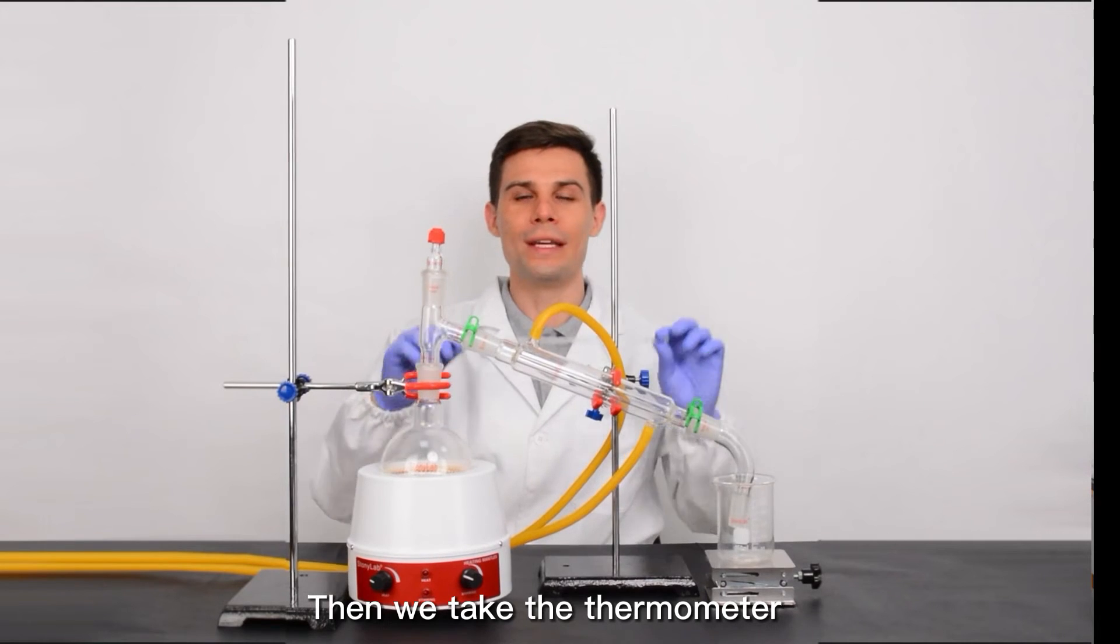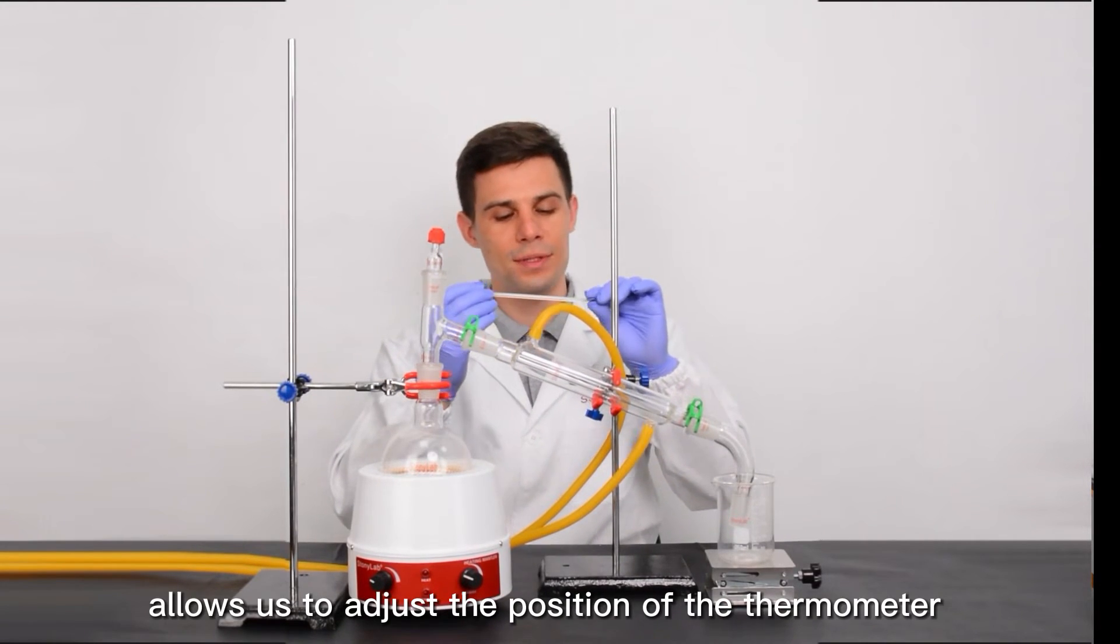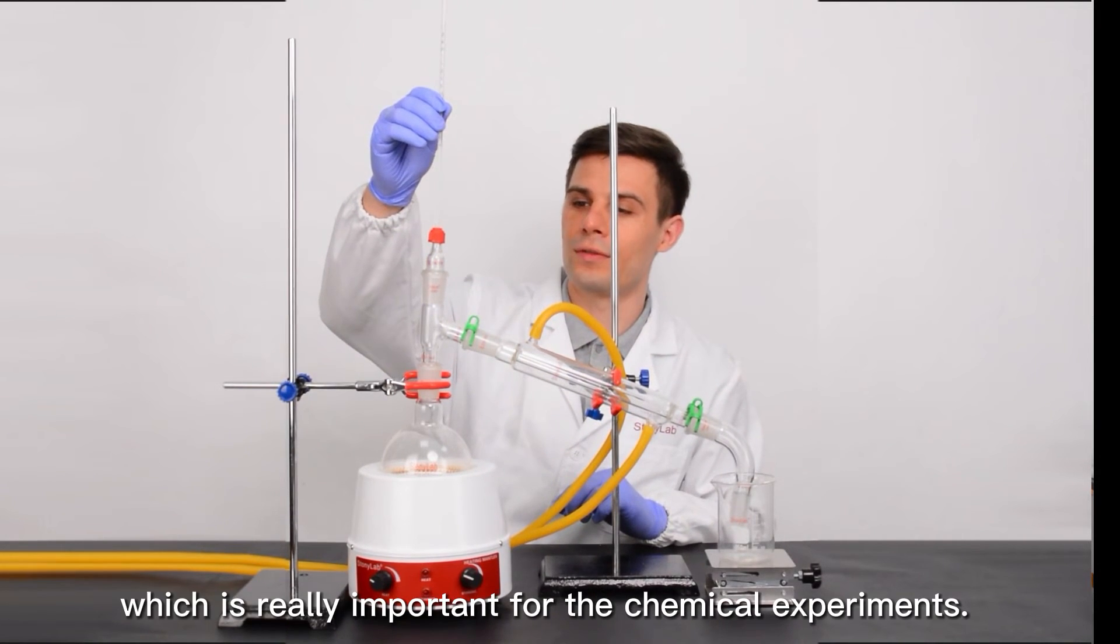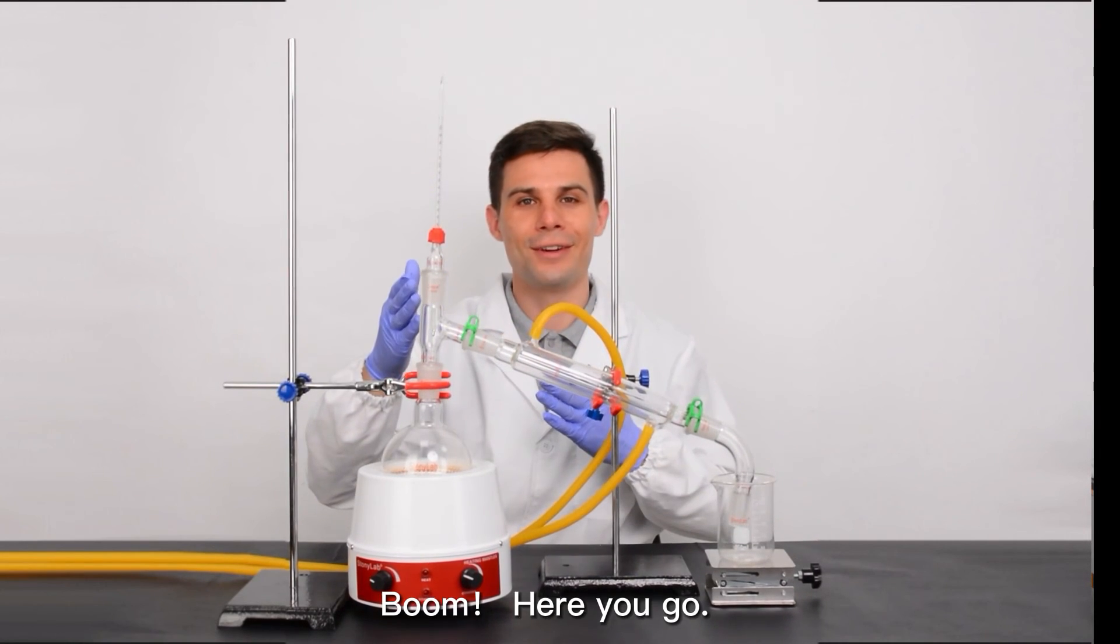Then, we take the thermometer and this adapter allows us to adjust the position of the thermometer to get the precise data, which is really important for chemical experiments. Boom! Here you go!